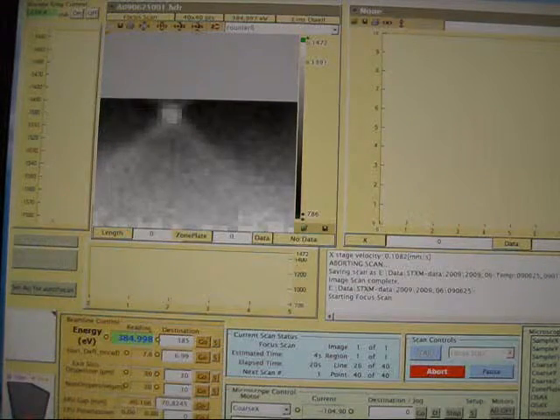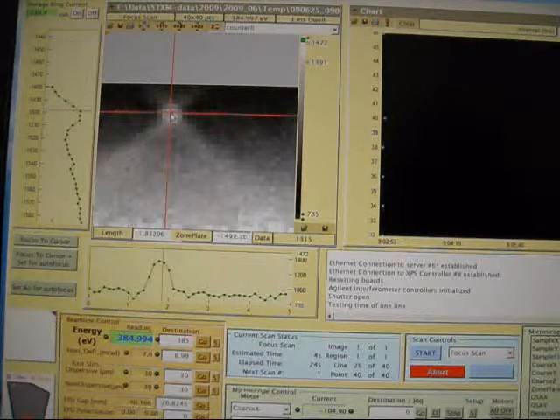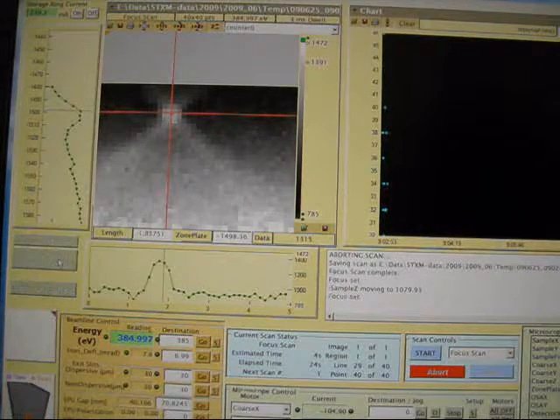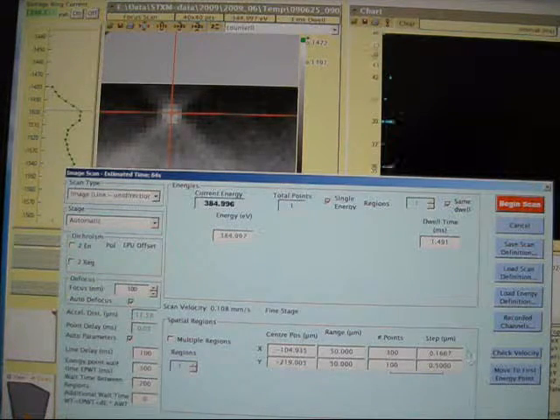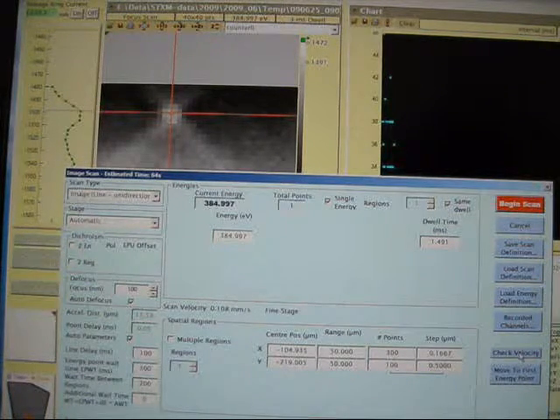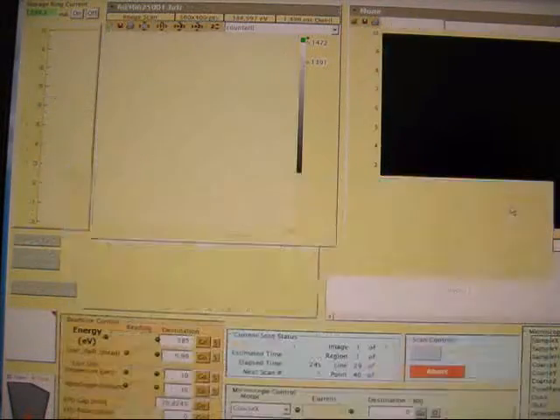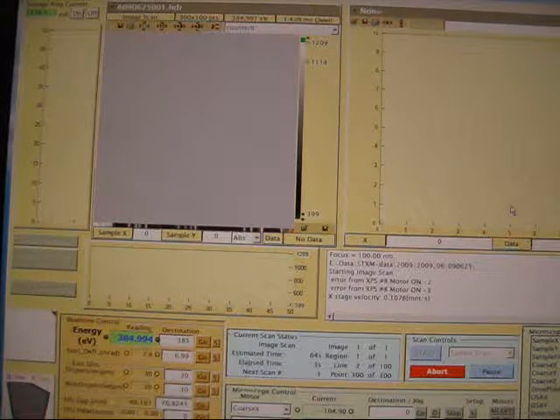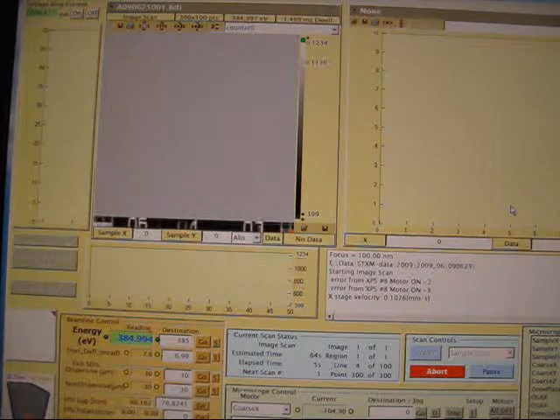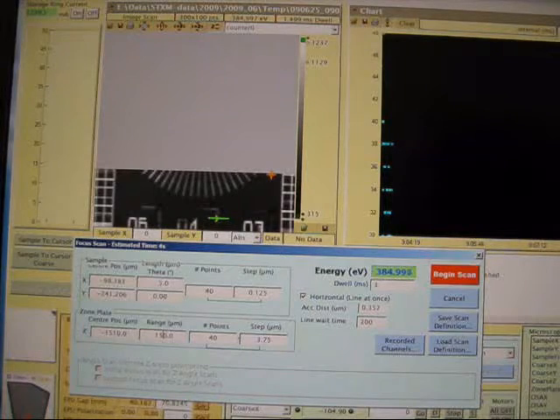And when the focus point is found, click on it and click focus to cursor plus set for autofocus, and then do another scan. This time we should get a better image. This time our image is good but not perfect, so we still want to do another focus scan.